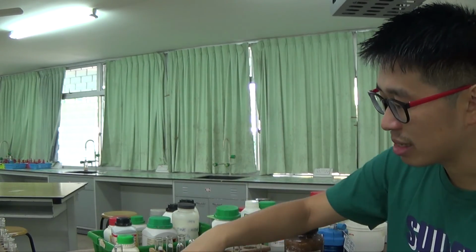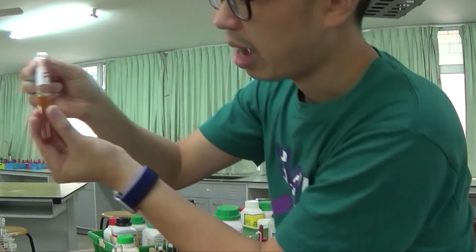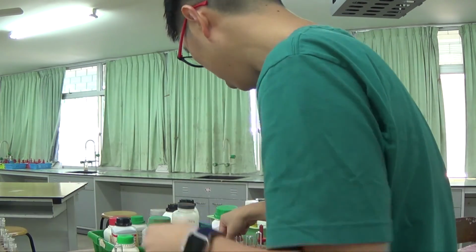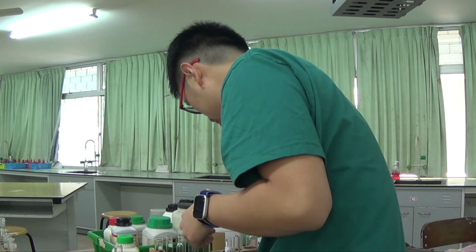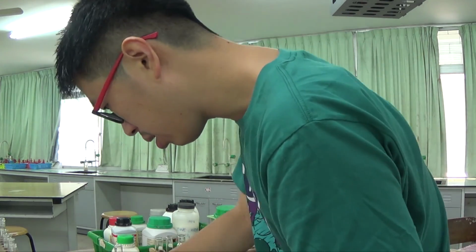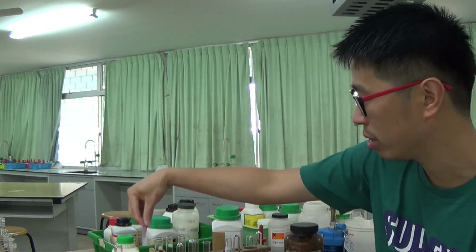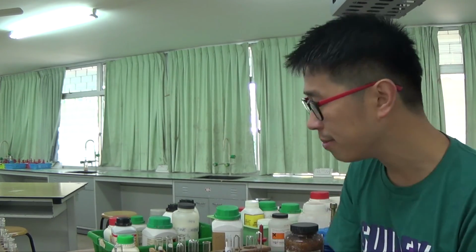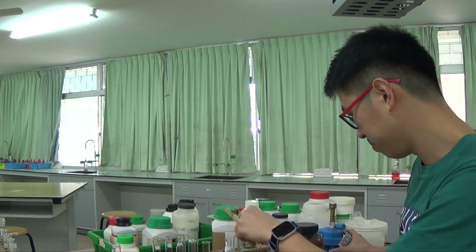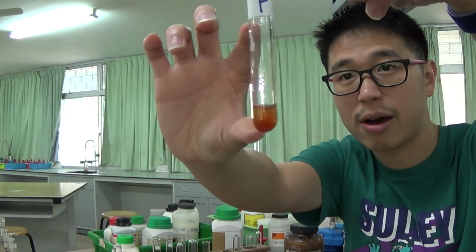And when I add the excess NaOH, I also need to test for the ammonium ions. So what I'll do is, I will remove most of the solution because I do not want to spill it again. What else? Okay, I ran out of my litmus paper. I already used 2 tests for ammonium ions earlier. But what you do again is, where's my other thing? This thing. You do not heat a test tube that is half full, okay?